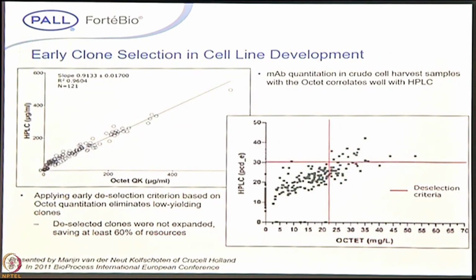In one comparison, they did early clone selection for cell line development. They did a correlation of HPLC versus the Octet platform. It is comparable with the other methodologies.